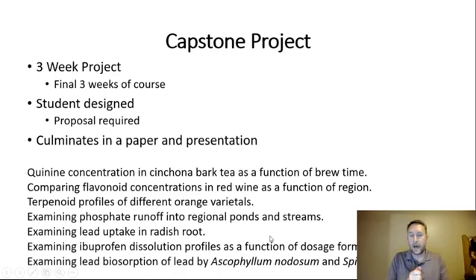looking at lead uptake in radish root and so on. So one of the really fun ones that I'm very interested in seeing the results of is looking at lead bioabsorption in brown and green algae. So there's a saltwater algae and a freshwater algae that we're going to see how they do in terms of lead bioabsorption.